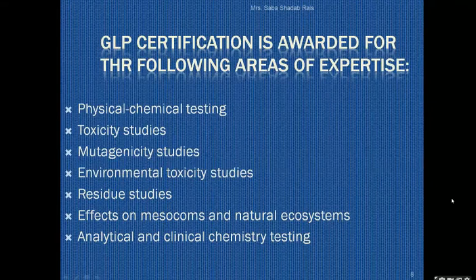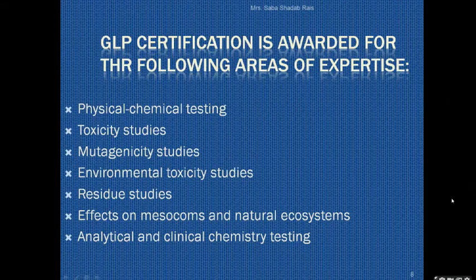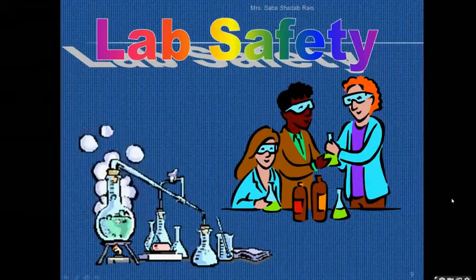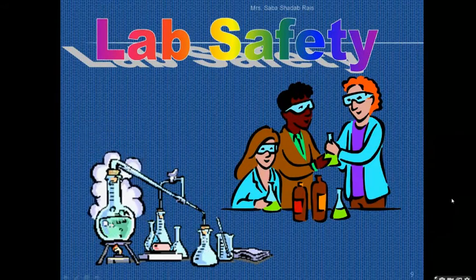Not only this, analytical and clinical chemical testing is also done. So this is about good laboratory certification, good laboratory practices. This is for the industrial level. Now for you, what you are going to follow, you are also going to come into the laboratory. So see, there are 19 rules before entering the lab. We make sure that you are going to follow these rules. What I am going to tell now is for you.